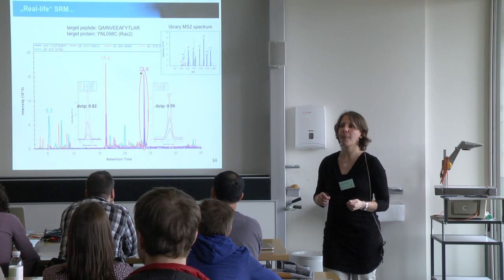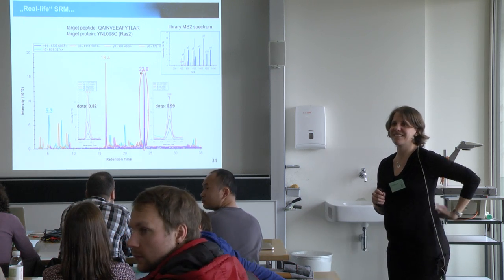Just to come back to the missing transition, one thing that you can do visually, even when you don't have a spectrum, and I've done this in lab meetings at the Makas lab, is if somebody puts up something and says, oh, this is my peak, and you look at the transitions, the selectivity of the transitions is also very important.